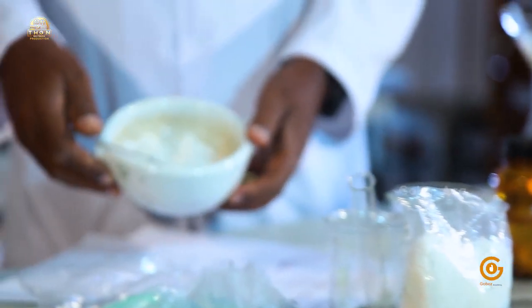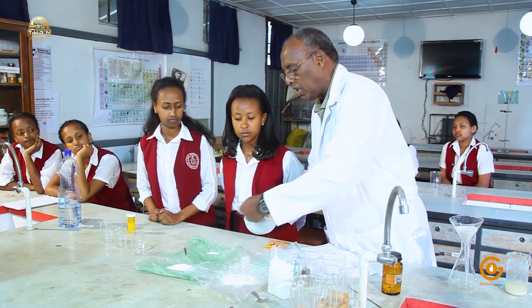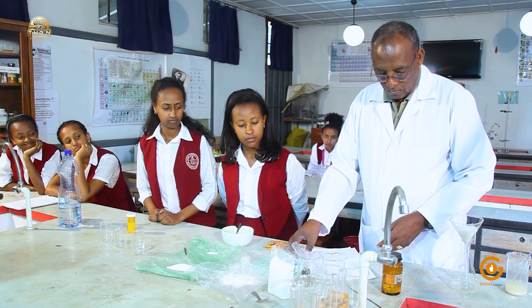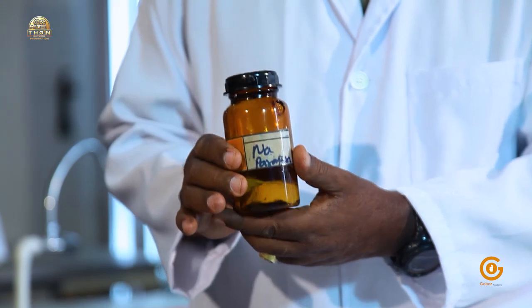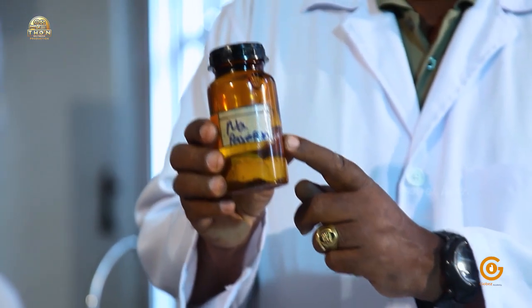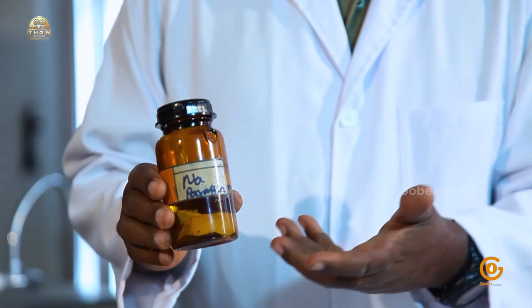Here we have ground sugar. We're going to see if that will make a difference in solubility between the ground and the unground sucrose, sugar. This is not, of course, a physical process. We're going to see if sodium, which is kept under paraffin, we'll take just a piece of it, drop it into water and see what happens to it.